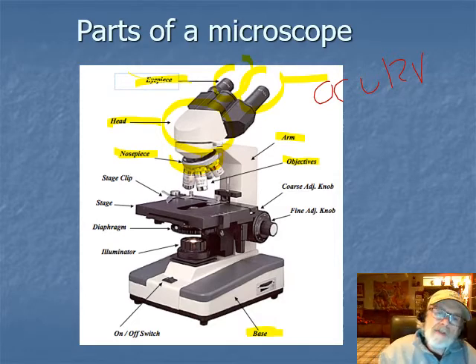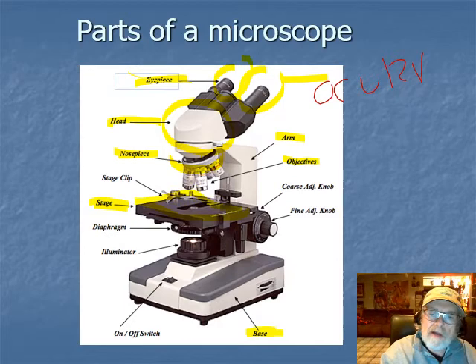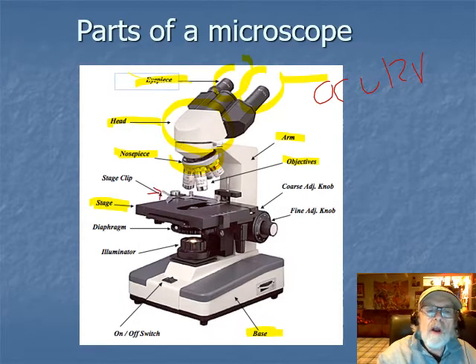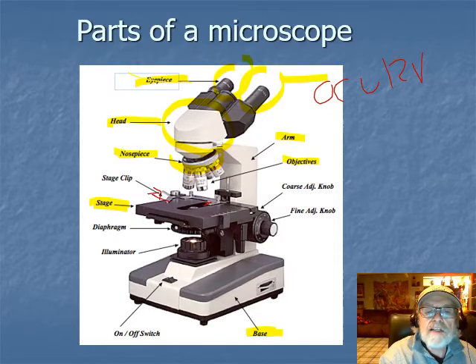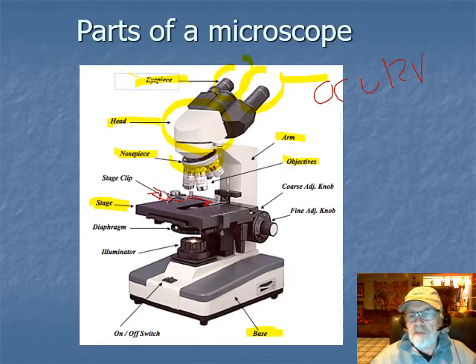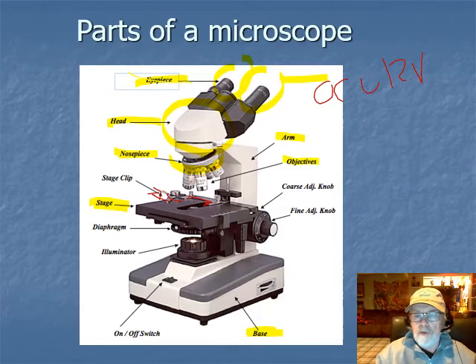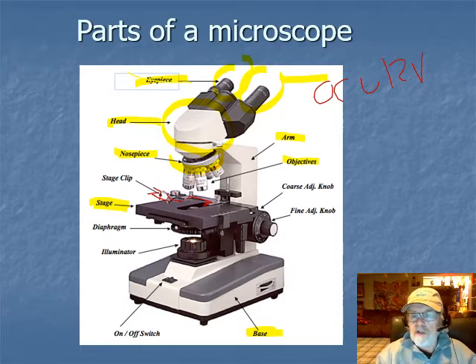The next part down on the arm is called the stage - this large platform is where you put the slide. The slide goes into what's called a slide clip. You pull the tab back, which swings a bar backwards, put the slide in and lock it in the corner, then let go and it locks the slide in place. That way the slide isn't moving around on the stage when you move the stage around.